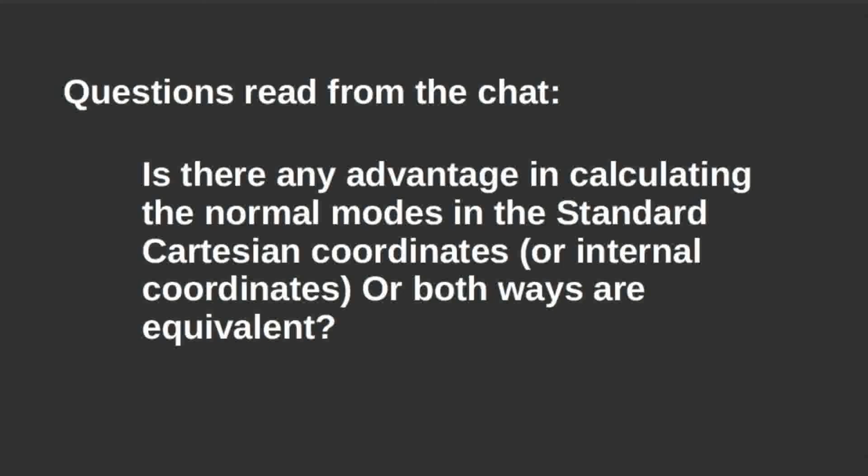But if you don't want to use an atomic structure, then you don't speak about internal coordinates, because internal coordinates are for atoms. This is how I understand. So for atoms, we have this RTB method. I'm not sure that this would help, but in any case, I didn't try.